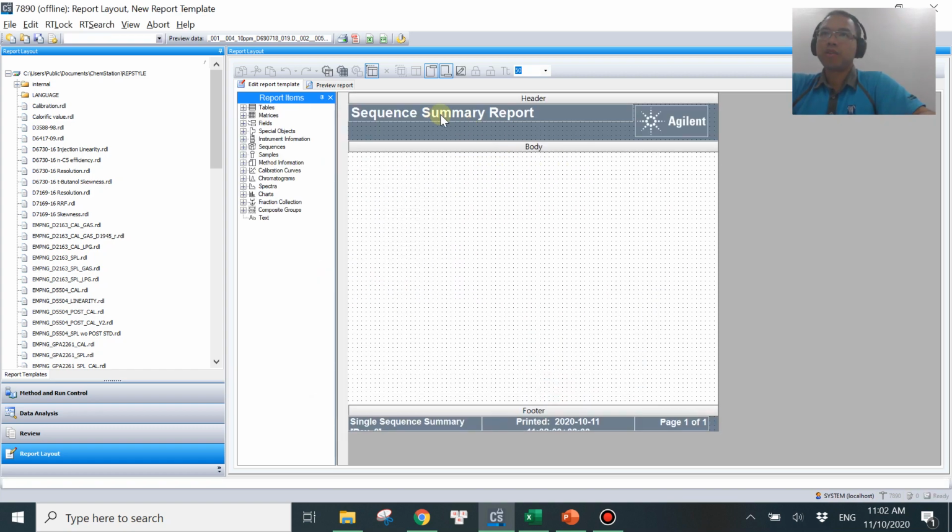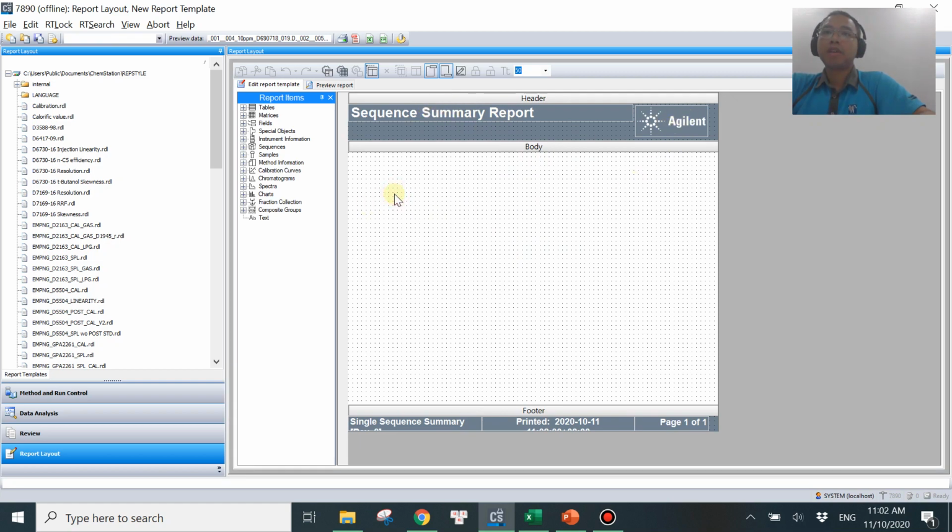Okay, so you can rename this, you can change the new logo if you want to, but in this video I'm just focusing more on the calculation. So the first item I want to wrap over is a table of all my 8 runs so that I know which data I'm working with, right? So that will be under sequence and sample summary here.